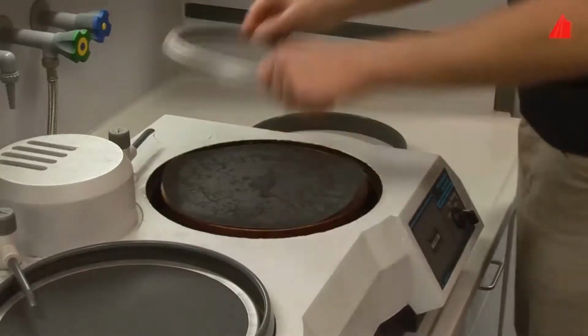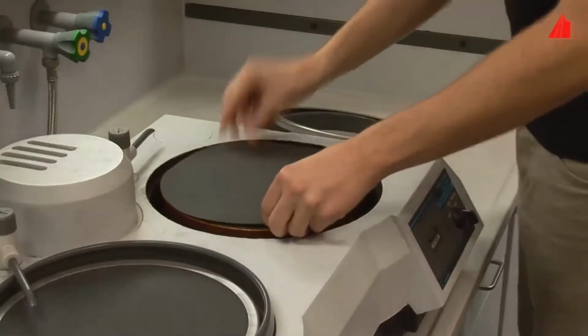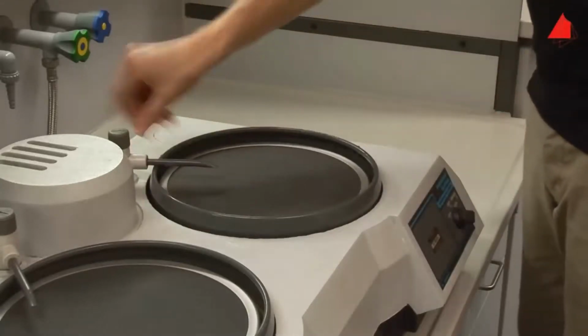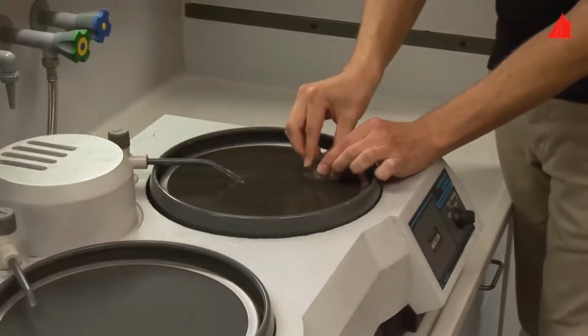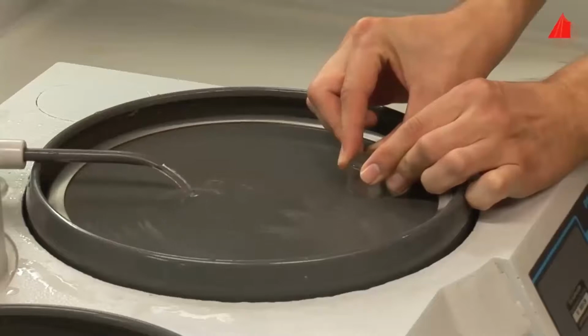He inserts a new 320 grit abrasive paper onto the disc. Rotating the specimen by 90 degrees leads to new grinding grooves perpendicular to the old ones. In this way, the material tester can easily check whether the old grinding grooves have been removed completely. It is important to use sufficient water flushing during grinding. This keeps the sample cool and prevents the abrasive paper from being loaded with material particles.